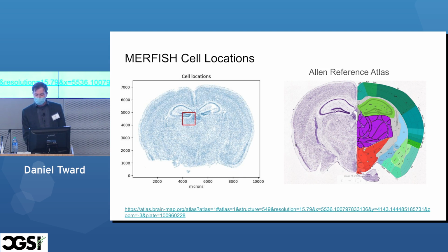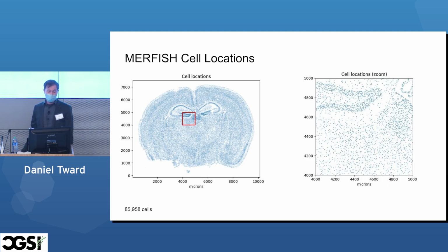Now, what's interesting is you can see the way that these brain regions are subdivided into smaller and smaller compartments. And you can't really see those subdivisions when you look on the left-hand side of this atlas. So neuroscientists use very complex patterns of cells, their layering patterns, knowledge of what connects to what in order to annotate this data set on the right. It has a lot of information in it beyond what you can tell just by looking at something on the left. Now we can zoom in on this little red box and see the level of single cells.